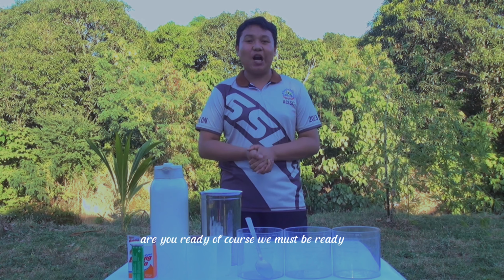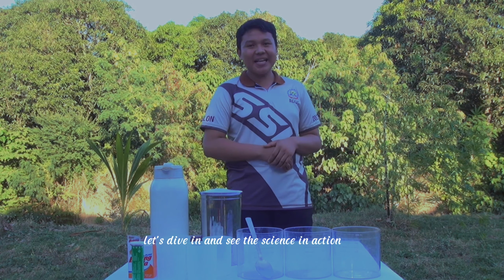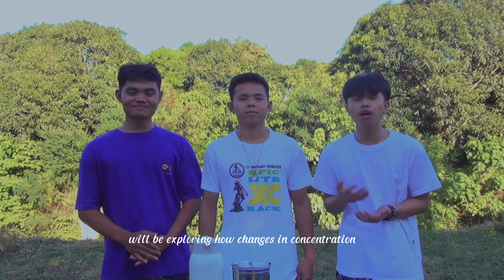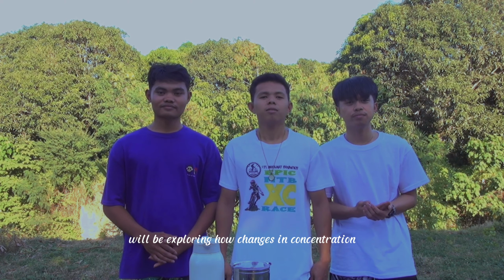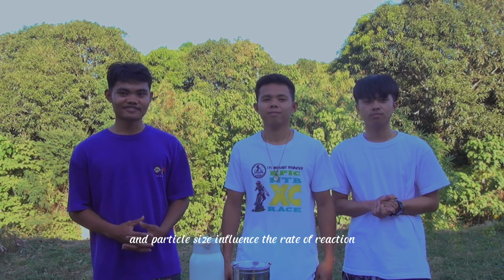Are you ready? Of course, we must be ready. Let's dive in and see the science in action. We'll be exploring how changes in concentration, temperature, and particle size influence the rate of reaction.